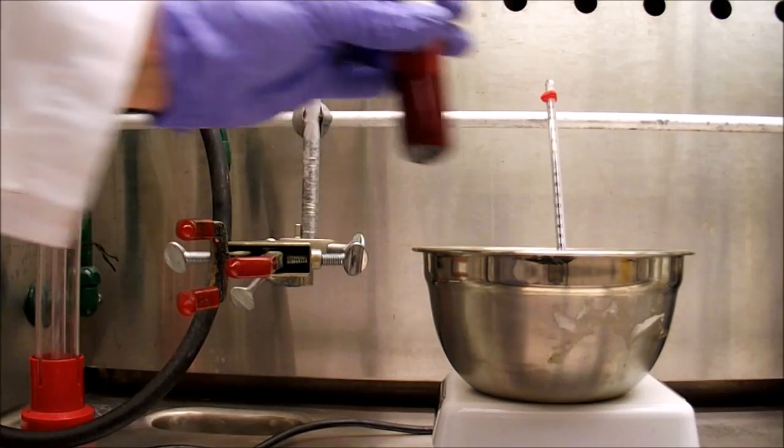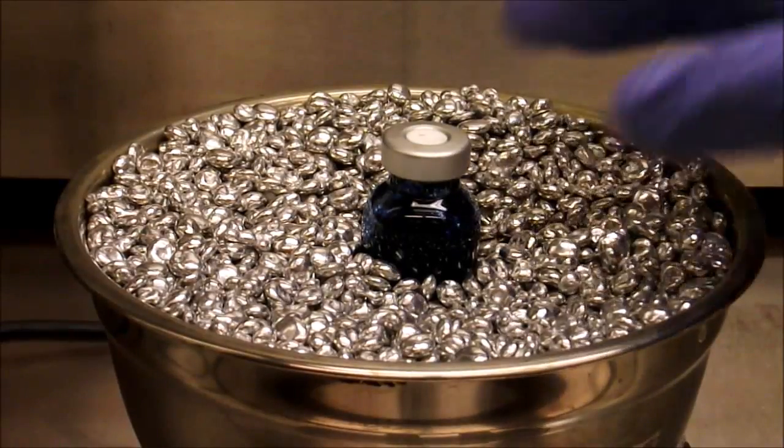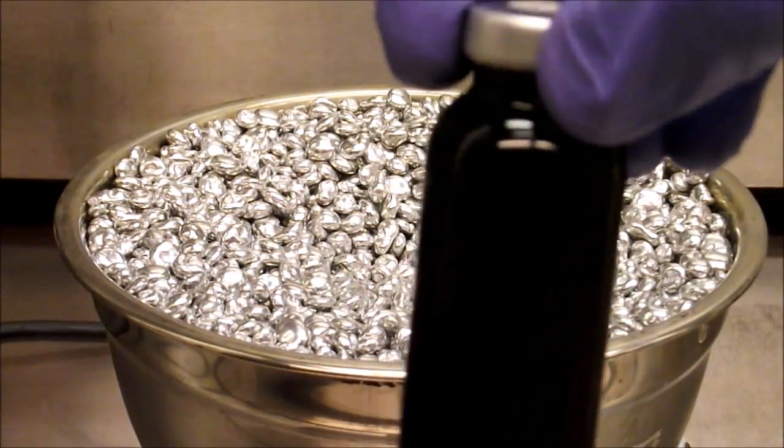Once the solvent has been added, the vial is heated in a bead bath to 100 degrees Celsius. After about 2 hours the solution has turned dark blue. This color change is highly indicative of the reaction being nearly or completely finished.